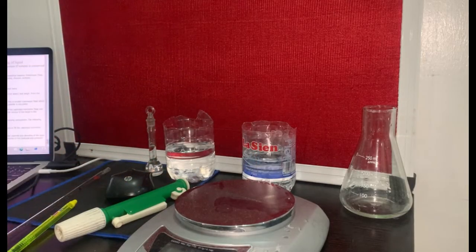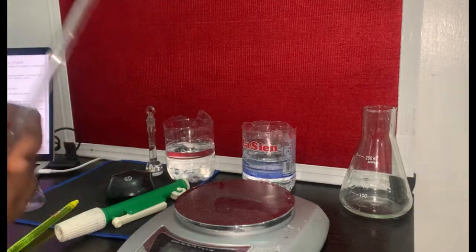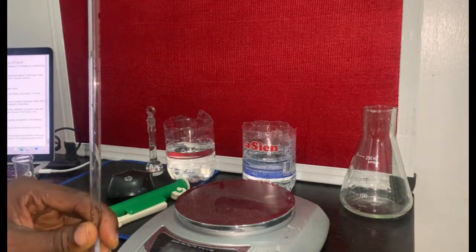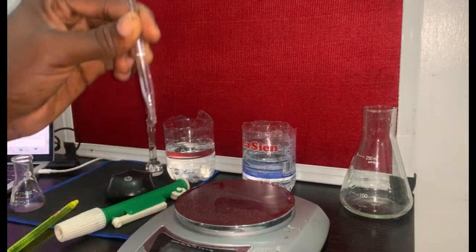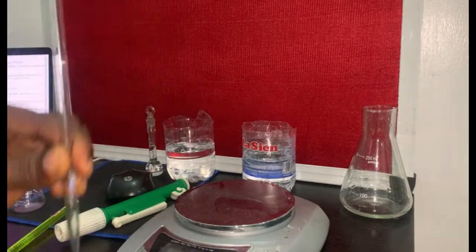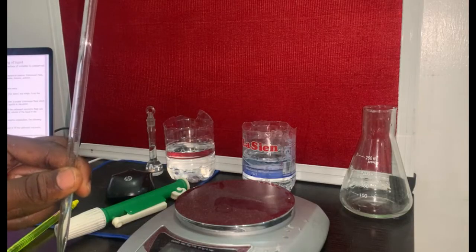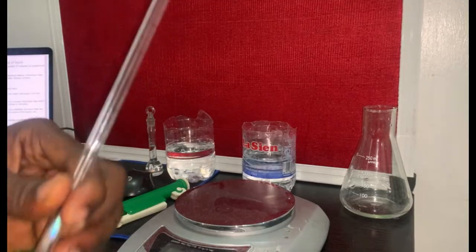So remember they said we should transfer this 5 successive times. You do the first one, the second, the third, the fourth, the fifth, but at the end of the day, it is the average that we are going to take. So if this delivered 5 mil the first time, 5 mil the second time, the third time, the fourth time, and the fifth time, we're simply going to say 5 plus 5 plus 5 plus 5 plus 5, in 5 places, divided by 5, because the number of times I made use of this is 5, which is obviously going to give us 5.